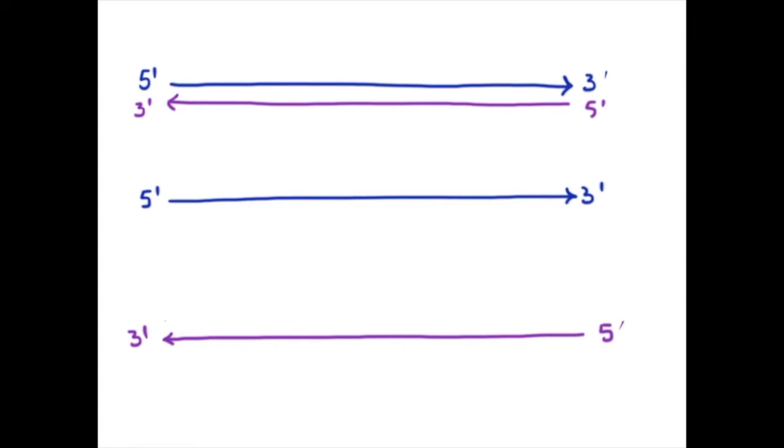The first primer anneals here on the bottom strand in the opposite orientation of the strand. The second primer anneals there on the top strand, also in the opposite orientation of the strand. Then elongation can proceed. The primers are elongated in the 3' direction, so elongation produces another copy of the top strand and the bottom strand. Let's now have a look at a concrete example.